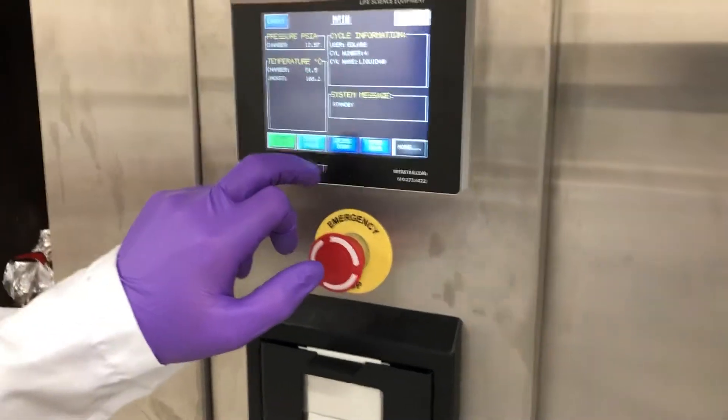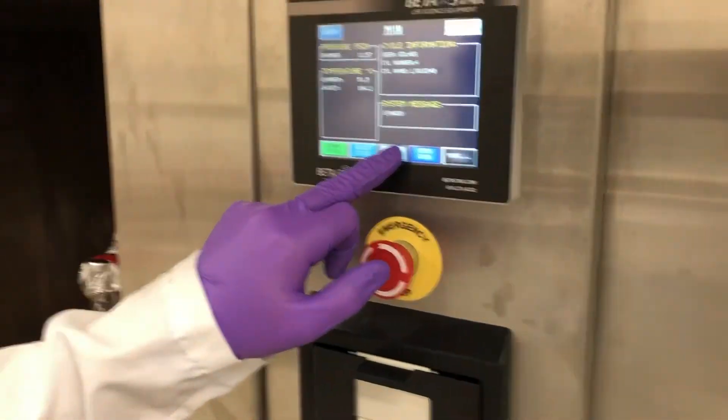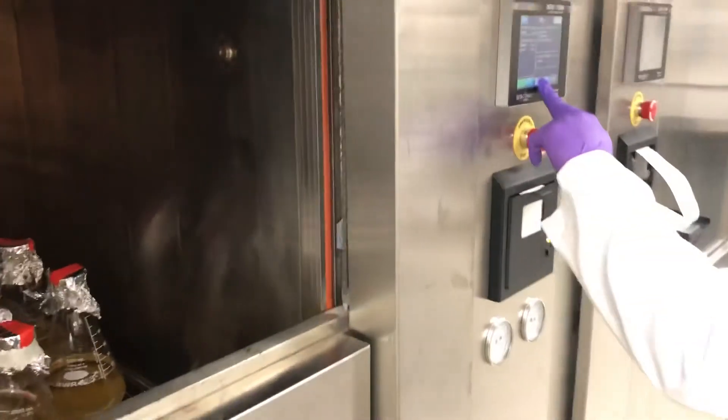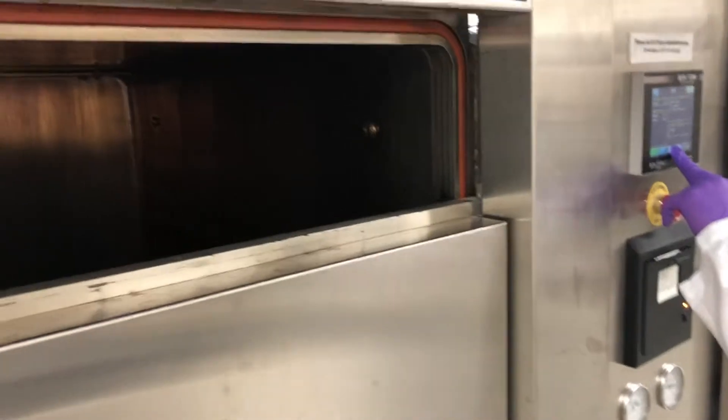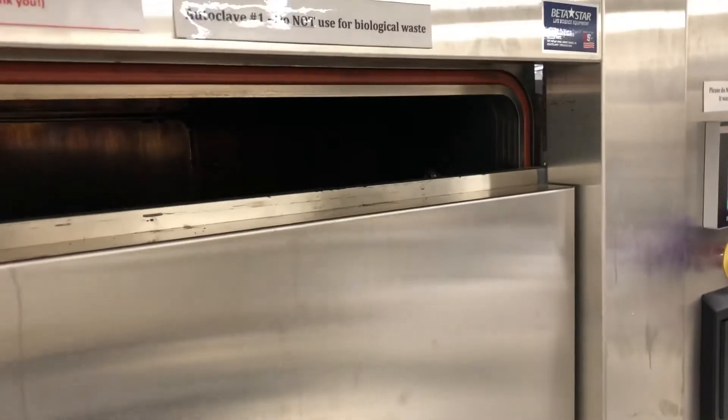You need to hold the closed door button until it's all the way to the top. If you let go halfway, it'll have to start over. The idea is that if somebody puts their head in while holding the button, they won't get hurt.